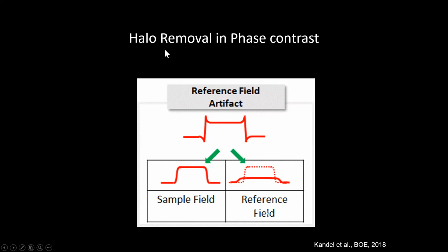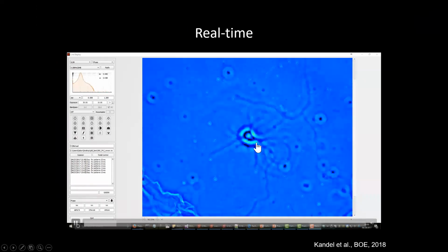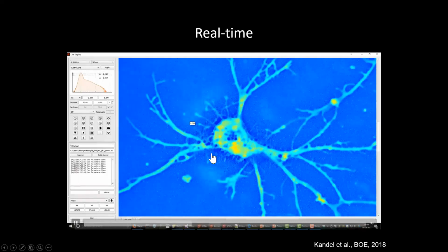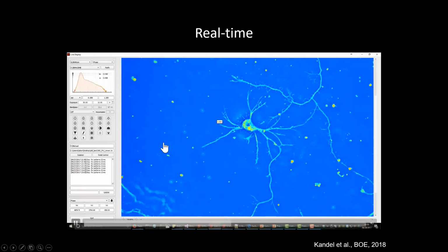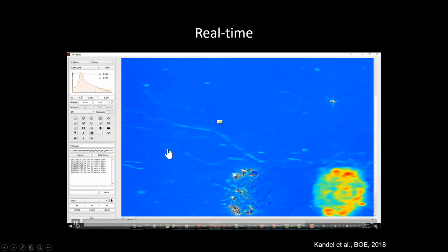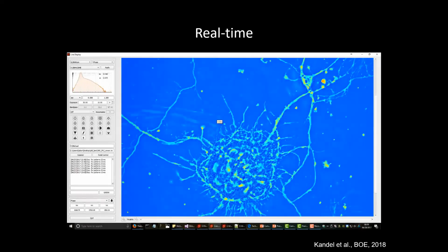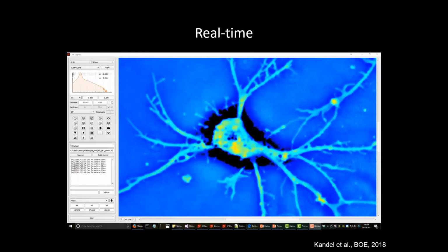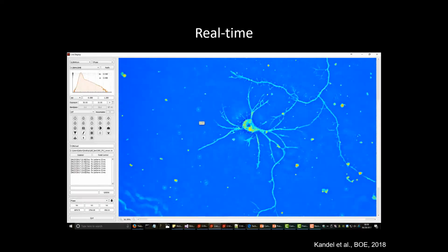This is kind of a parenthesis, if you like. The Nobel Prize winning idea of phase contrast actually comes with an artifact that everybody knows, and it's called halo. This is kind of a technical discussion, but because that ring where the incident light is focused is not infinitely thin, because it has a finite thickness, it means some scattered light, that's not the incident light, also gets focused there. So it gets focused in the wrong place, so to speak. So biologists basically lived with it for decades. They even use it when the cell divides, actually you see a more pronounced halo.